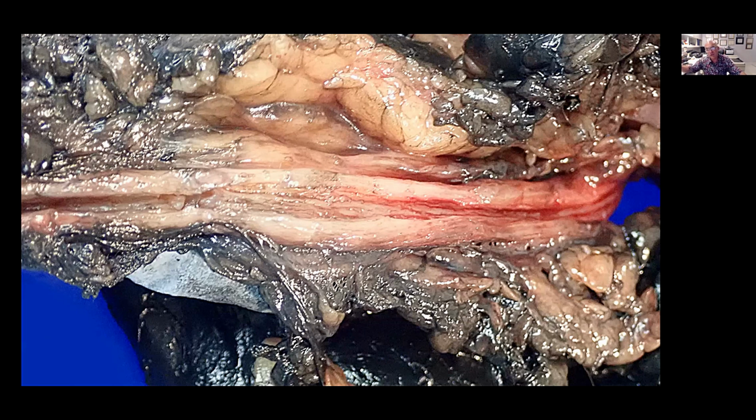left radical nephrectomy with ureterectomy. And if you even want to document that it's a real ureterectomy, you can put in parentheses the length of the ureter, 10 or 20 centimeters, to just show whoever is reading the report that it was a real dissection of the ureter that usually is not present in other kinds of radical nephrectomy. So the removal of a significant section of the specimen means something. And then you need to document that and put an additional item. In addition to the kidney diagnosis, you need to put the diagnosis of the ureter as well.